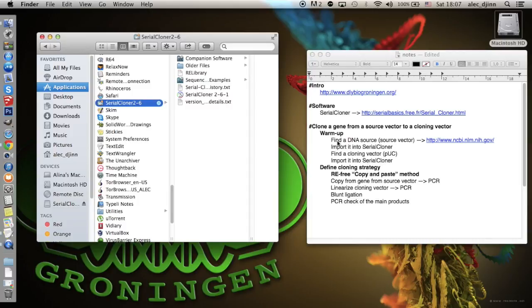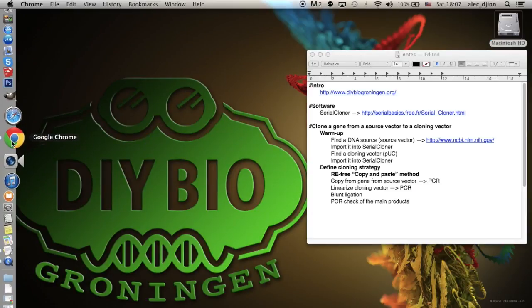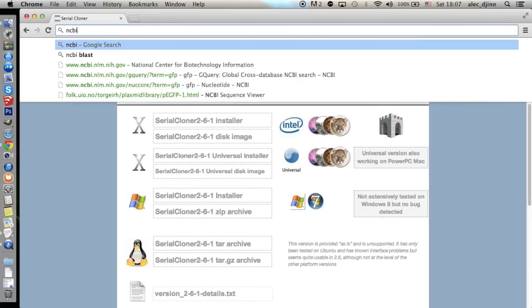Now that we've installed the software, we need DNA sequences to work with. More precisely, we need the GFP coding gene.